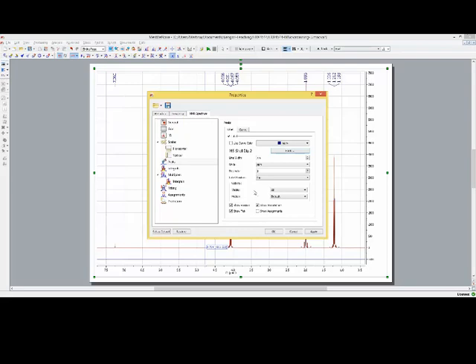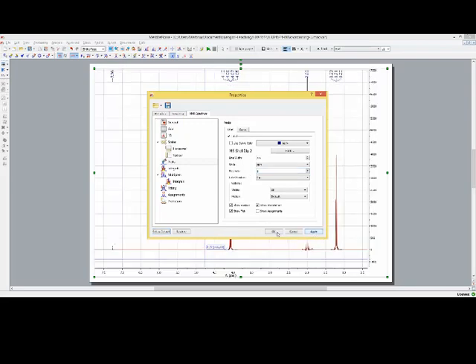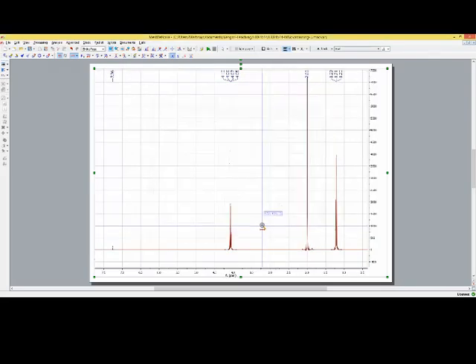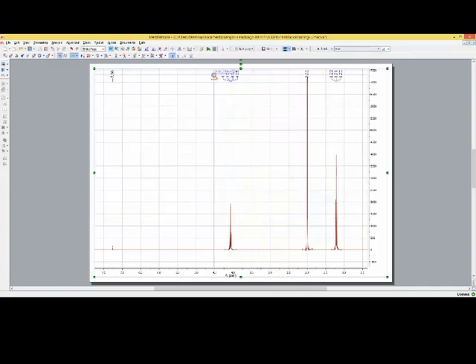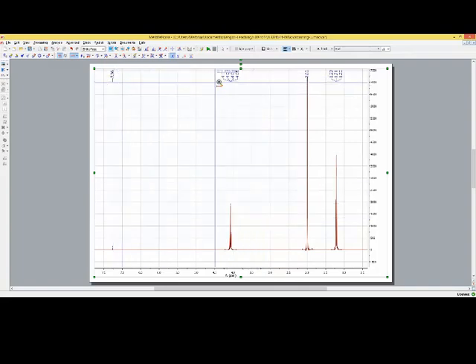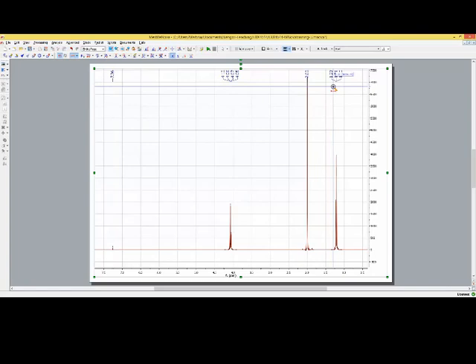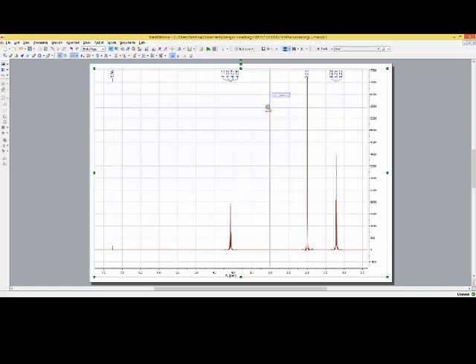Also you may not want to have so many decimals. For the chemical shift for proton NMR data it's absolutely sufficient to have two decimals. You can either apply this one or you can just say OK. So now we have the chemical shift for all our signals.